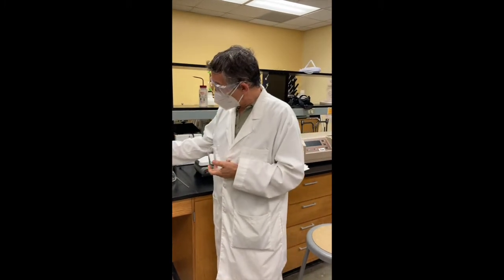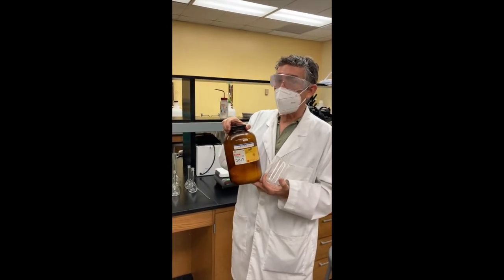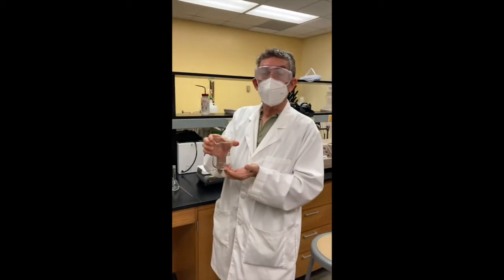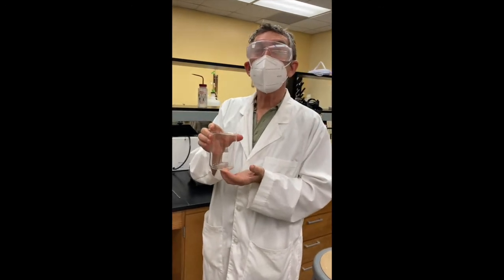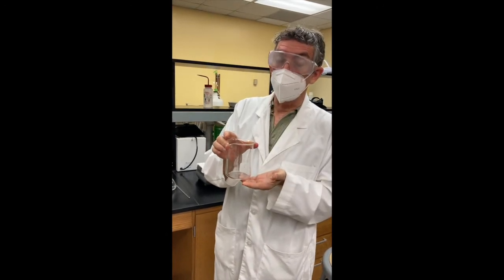We have to weigh out our sample of polyvinyl alcohol. We have to know exactly how much we have by mass, so in the process, we cannot lose any. We'll put it into water and create the solution. We have to make sure every little bit goes into solution, and when we're done, we can't leave anything behind on a stir bar, for example.